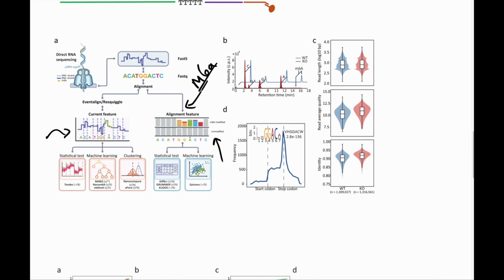variability in the actual base calling quality at that particular point. So that could be based on the Phred score decreasing by 5. The Phred score itself is a metric for the confidence that the sequencer has in a particular base call that it's making. So in that case, you don't even need any error, like an adenine switching to some other base. You just need an adenine with a confidence of 20 versus an adenine with a confidence of 15, which is a lower quality.